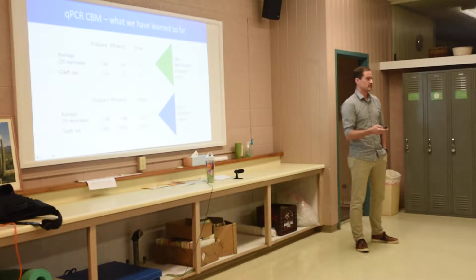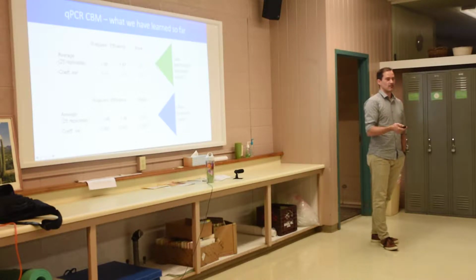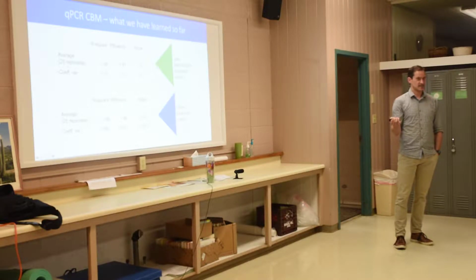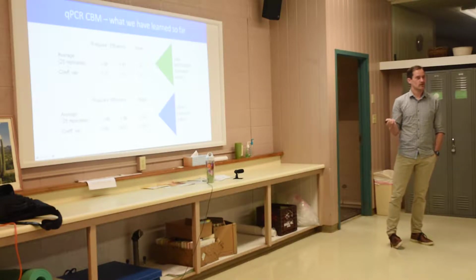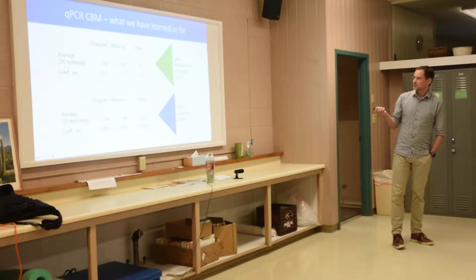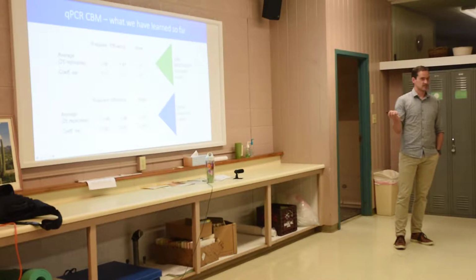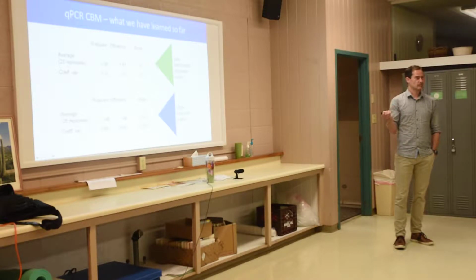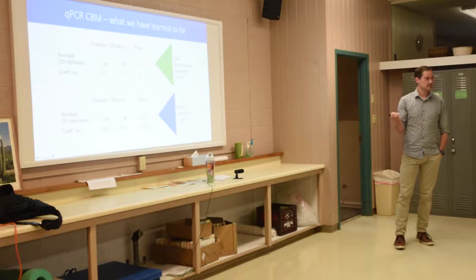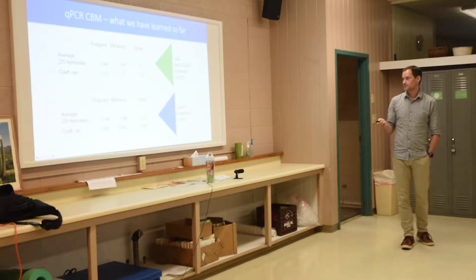And that's really important, because a criticism of CBM, of a community-based approach, is that the variability is inherent in the community partners. And this is where we're trying to say, well, maybe for some assessments that's a variation, but I would argue that that's a variation that would be inherent between any two individuals. But qPCR takes out the variability because it just tells you a value. So as long as you do the method properly to set up a qPCR, you will get these results routinely and consistently. And that's really important.